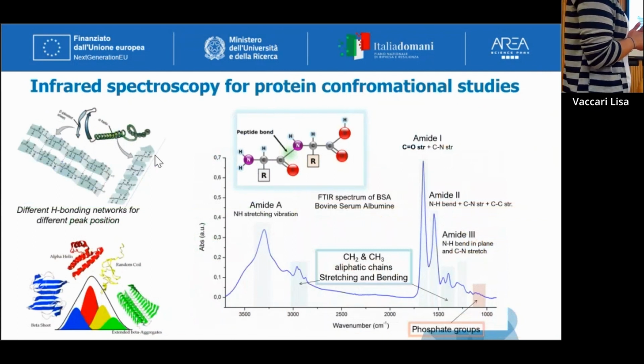because it's something that can maybe be more understandable for you. So, as I told you, infrared probes vibrations, and with vibration, I know which molecules are vibrating. Because I know that this spectrum, which is very boring, provides a lot of info. There are some absorption bands, and these bands are related to the molecular constituents that are vibrating. This is the spectrum of a protein.